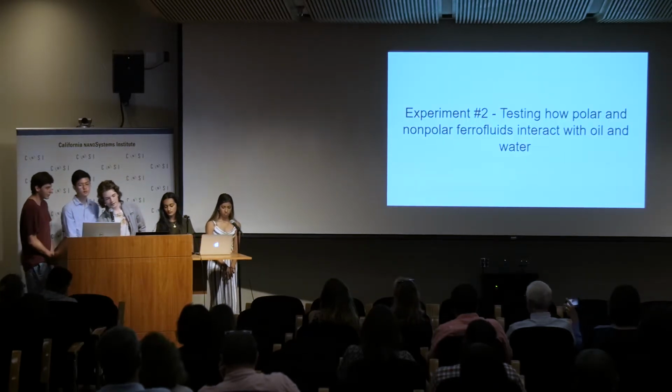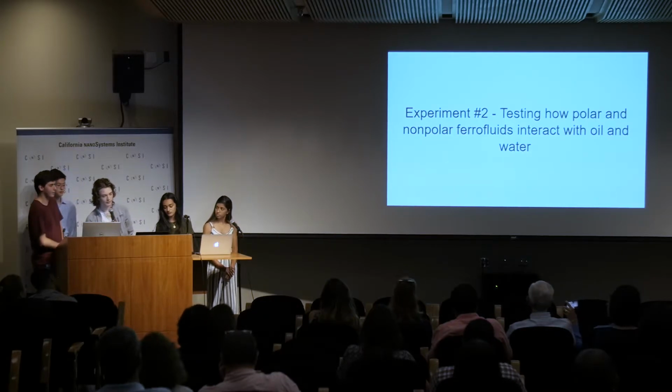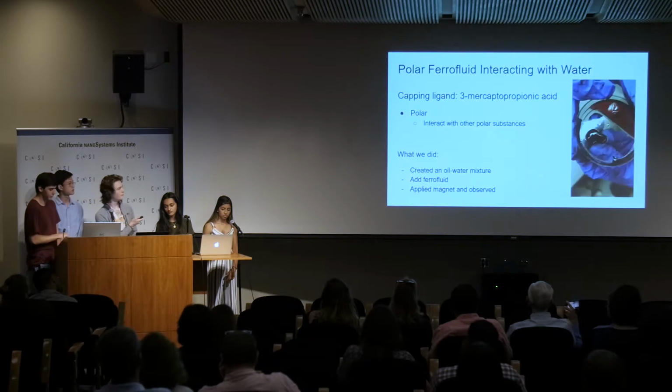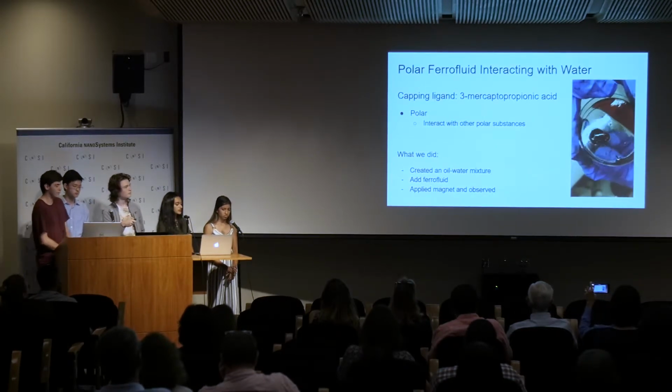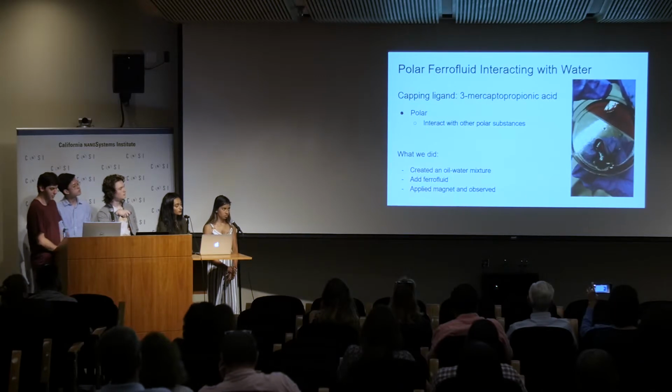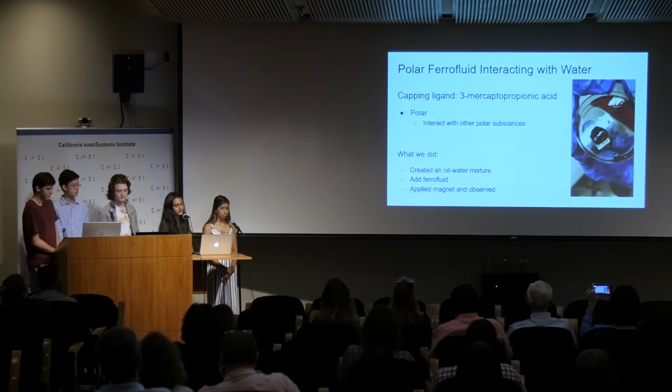So our second experiment was testing how polar and nonpolar ferrofluids interact with oil and water in terms of separating the two. So in this experiment, we took a petri dish and mixed oil and some water. We dyed the water red so you'd be able to see.